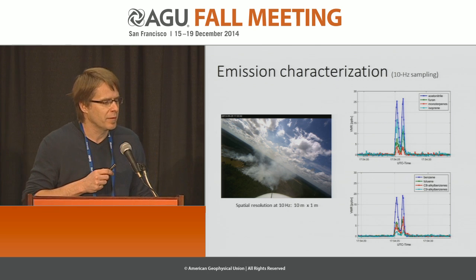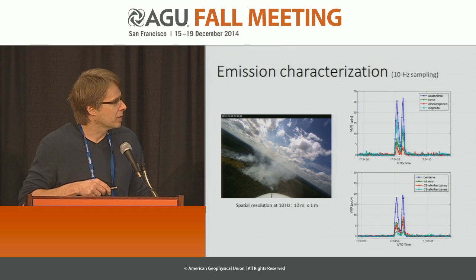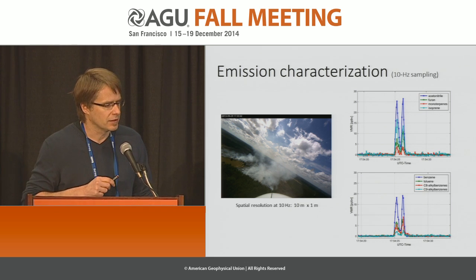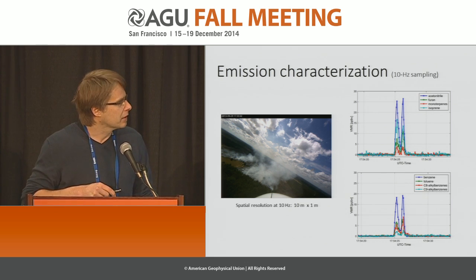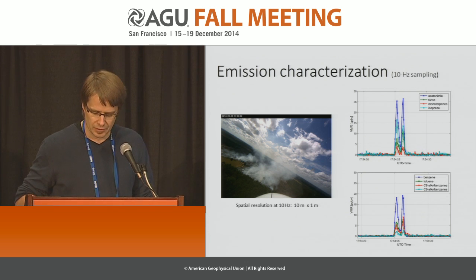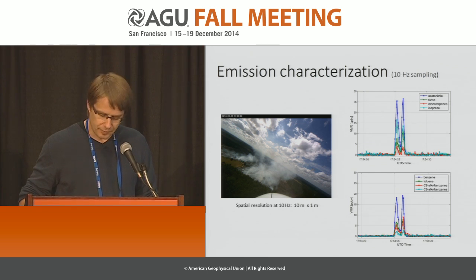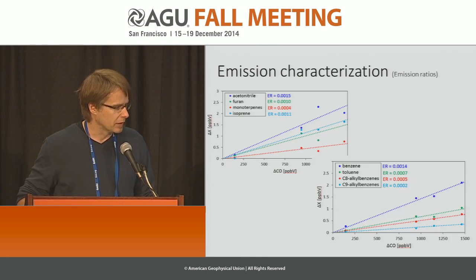If you measure at 10 Hertz, even when we measure point sources, we get very good signal to noise. So we are able to resolve even these small plumes, and Markus has calculated this. At 10 Hertz we have a 10 meter horizontal resolution and 1 meter vertical resolution. So we can really sample these plumes properly.